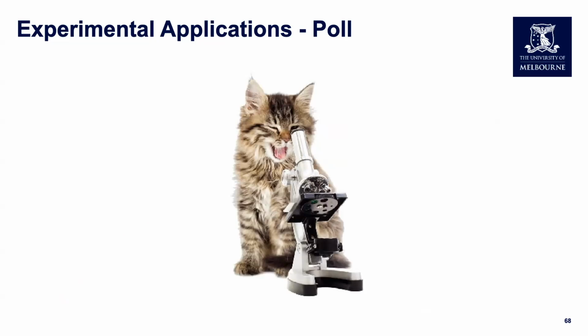Okay, so for these two questions, the first question is, if you would like to identify subcellular structures which are greater than 250 nanometers, which is, if you remember, our diffraction limit, which of the following techniques would you choose? So in this case, the correct answer I had selected was confocal, but I guess you could also use slide scanner and light sheet. The D-STORM application would be primarily for structures which are smaller than that diffraction limit. So that's the super resolution technique.